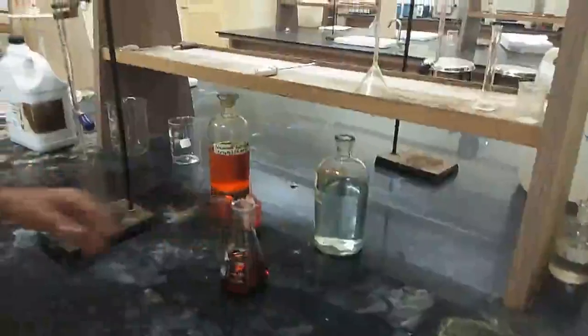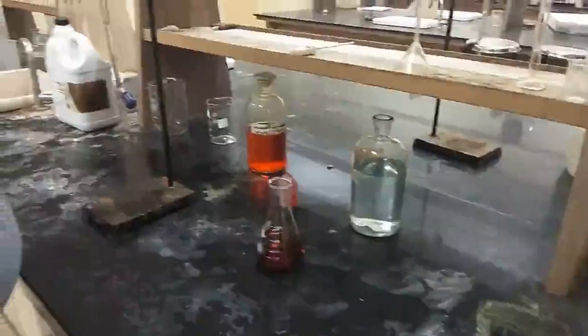So now we are going to do the similar titration for our next sample as well.